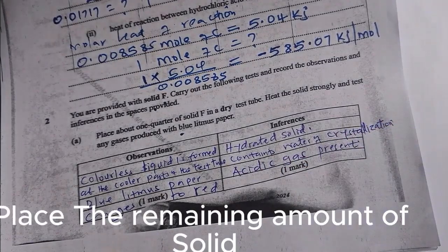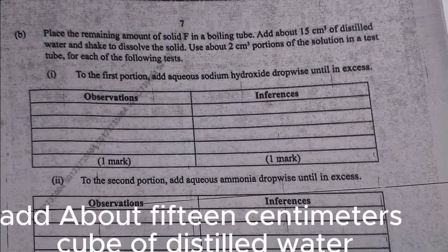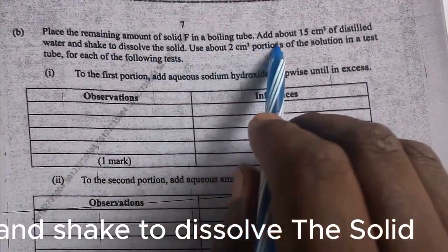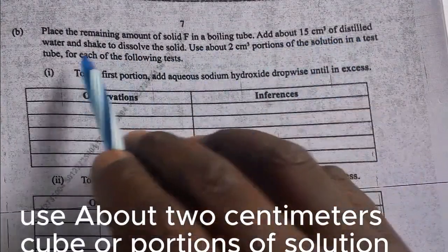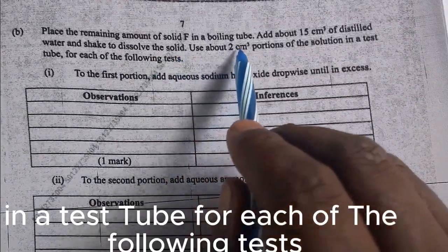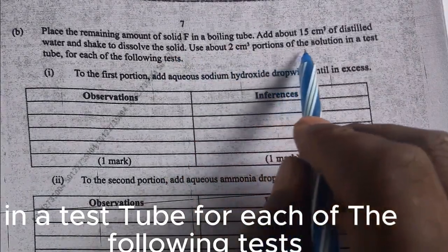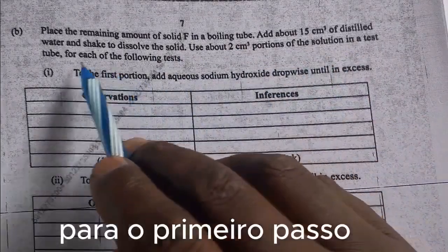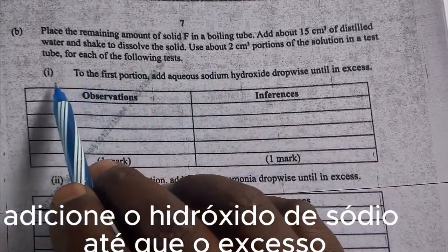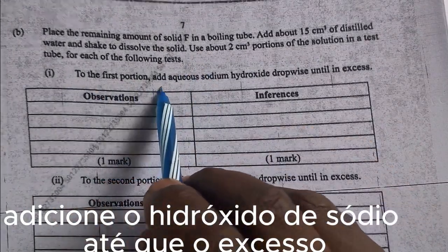Place the remaining amount of solid F in a boiling tube, add about 15 cm³ of distilled water, and shake to dissolve the solid. Use about 2 cm³ portions of the solution in a test tube for each of the following tests. For number 1, to the first portion, add aqueous sodium hydroxide dropwise until in excess.